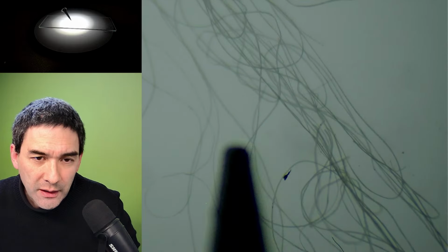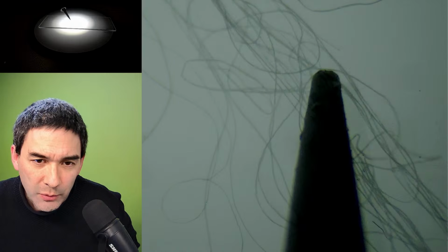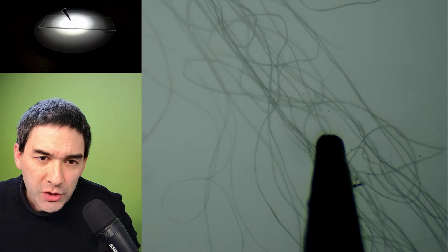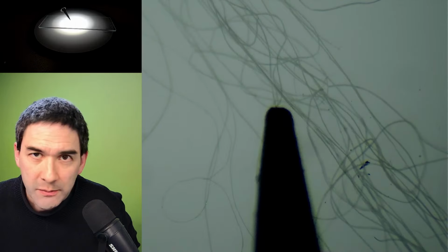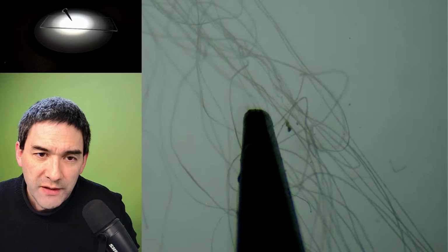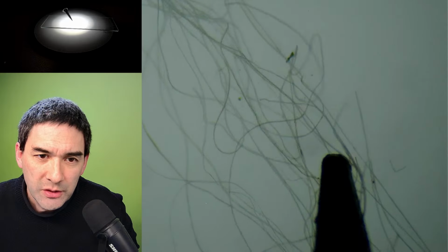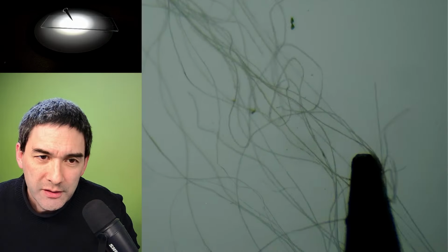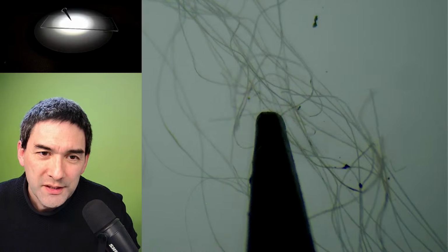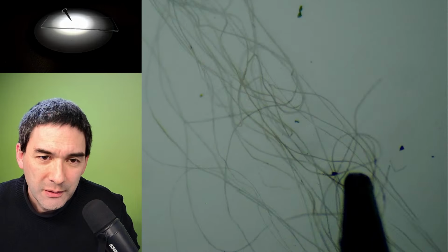Okay. And what they actually say is that if you touch it, you see that it doesn't melt, number one. And number two, if you keep on doing this, it will actually start to char and turn brown, obviously, because it's going to burn, right? But I think it's very clear simply from the behavior. You can maybe already see it slowly starting to change color, starting to become fried a little bit. So this is a sign that we're not talking about some kind of plastic.